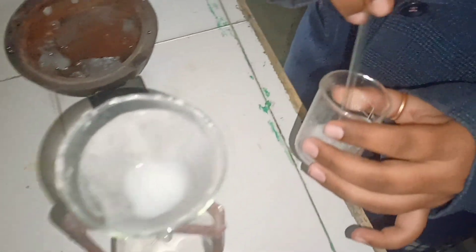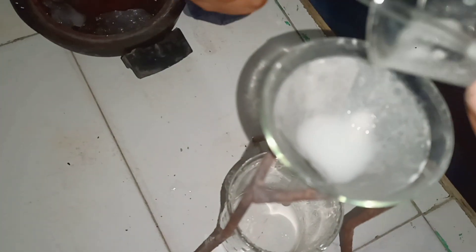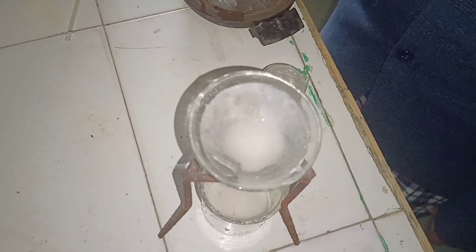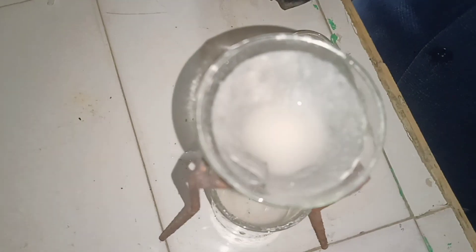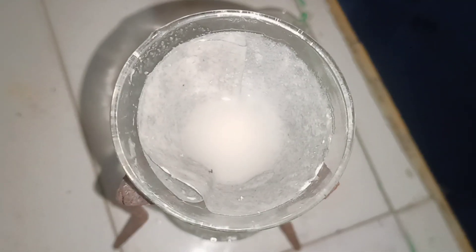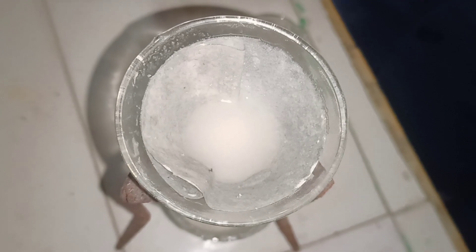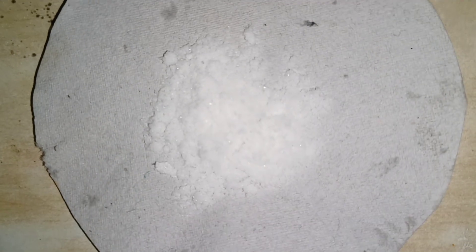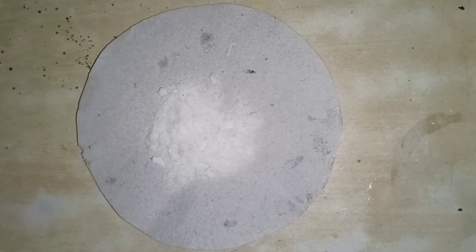We will scratch it with the glass rod. This is our required potash alum. After drying it, we will get the proper fit curry. After drying it, we will get it in this form, and we will be using filter paper to collect it.